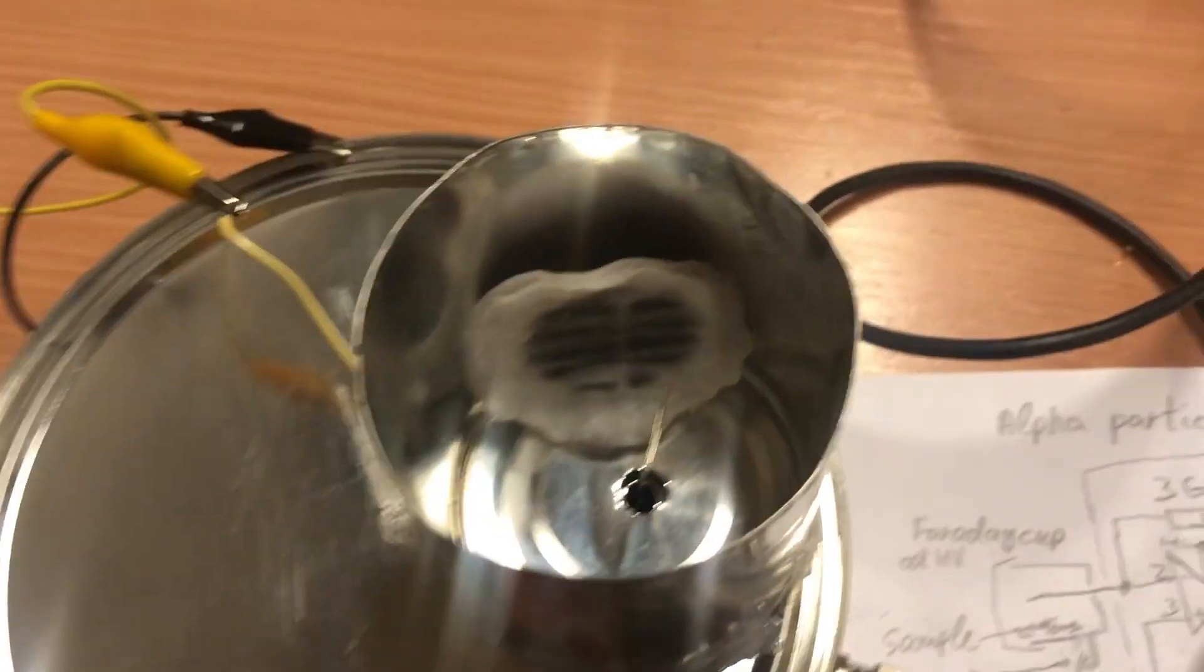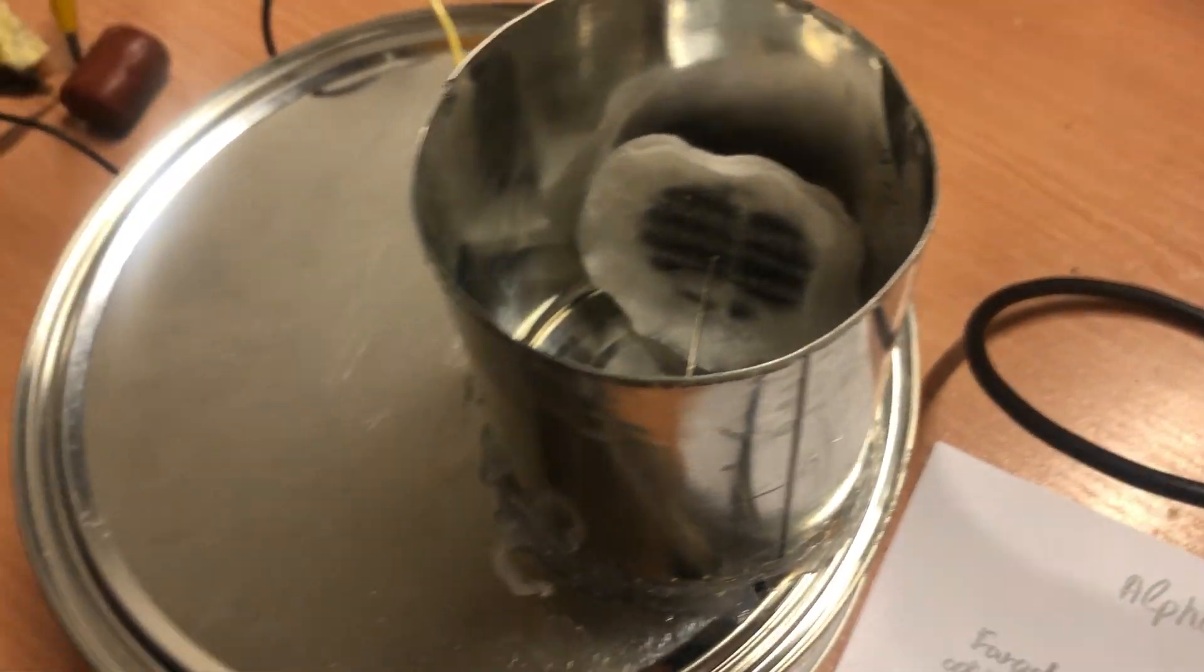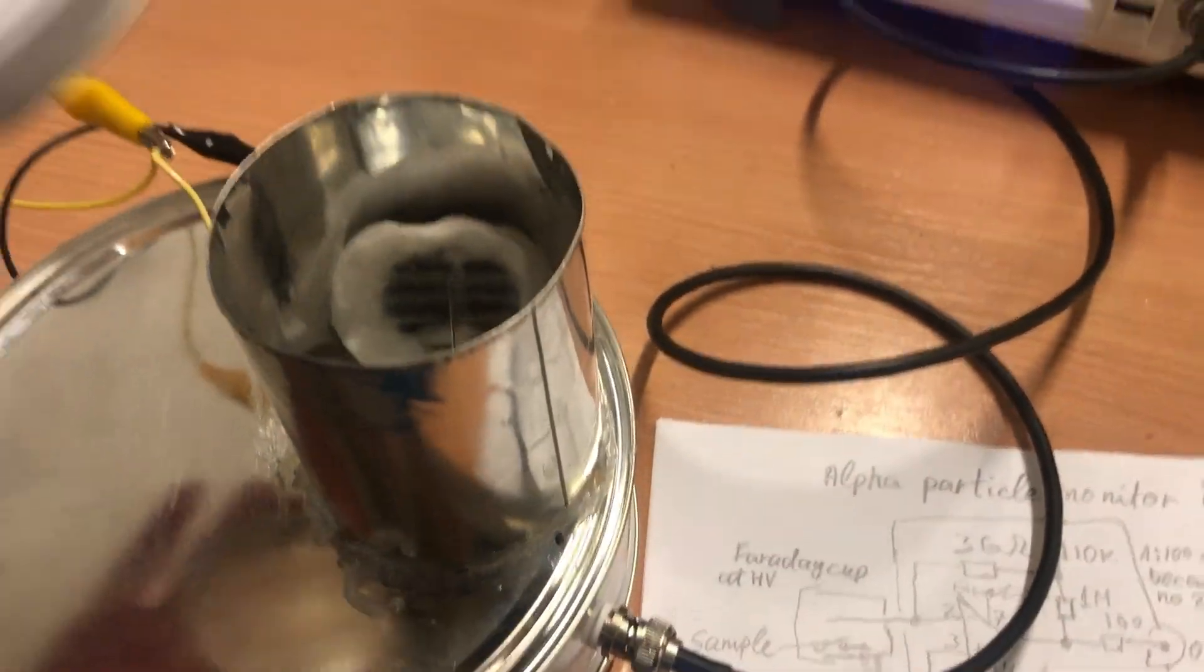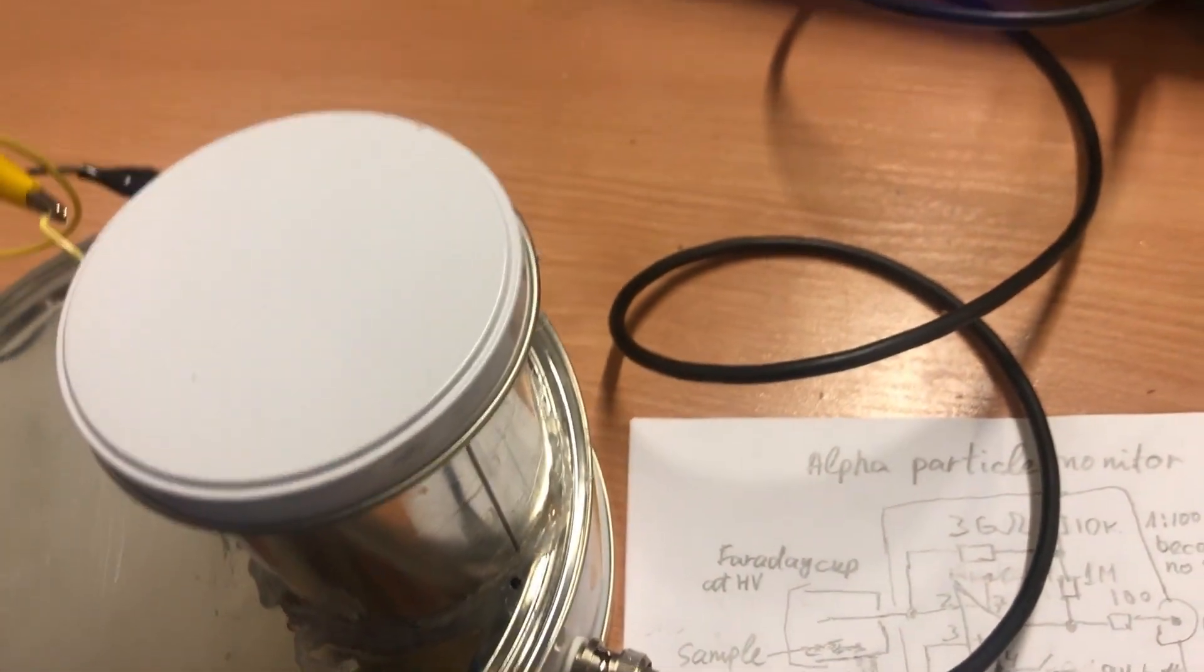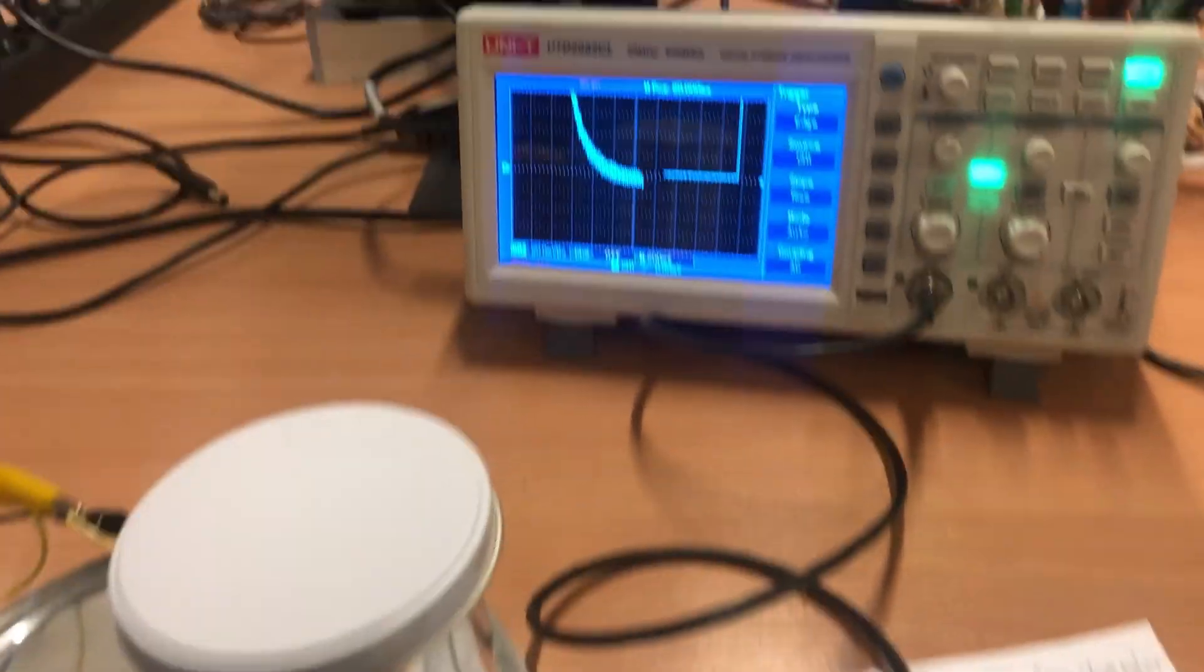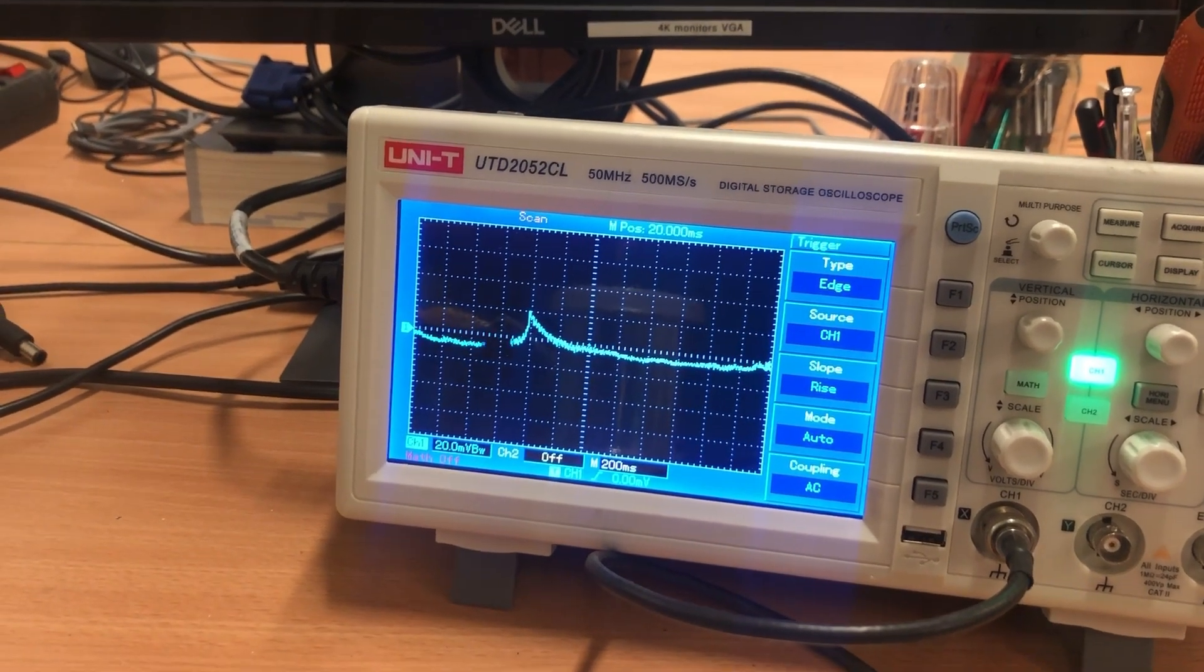In the Faraday cap we see cotton sample with black soot from filtered air, and it contains some radon decay products. So we close the cap, switch on amplifier, and on scope see pulses.